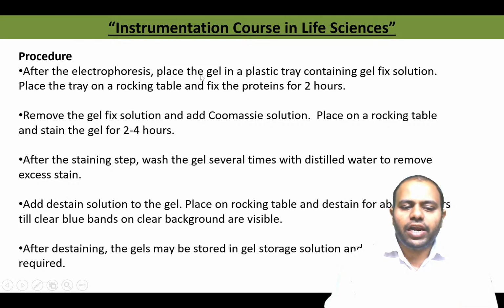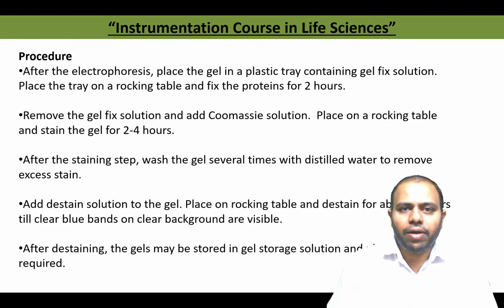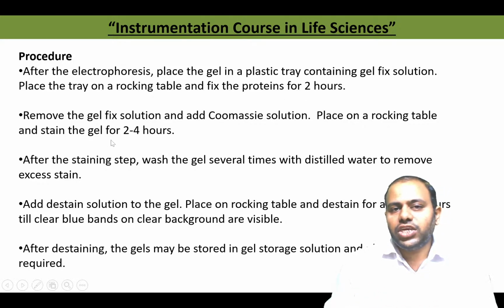So after electrophoresis, the procedure that is followed is, carefully you have to remove the gel from the tray, then add a gel fixing solution, and after that remove it, and add Coomassie brilliant blue solution. It's a generally blue colored dye, and you have to keep it on a platform rocker, a rocking table, where the stain will be evenly spread. You have to stain the gel for 2 to 4 hours if you are using Coomassie brilliant blue, and then use the de-staining solution to remove the excess stain.